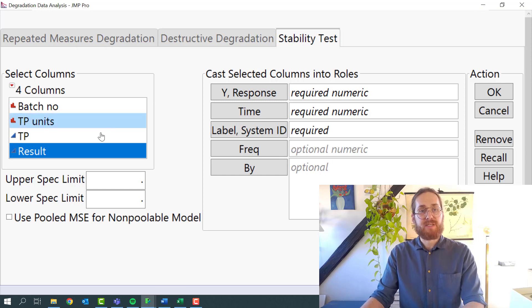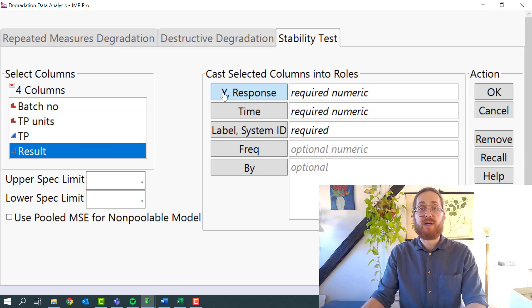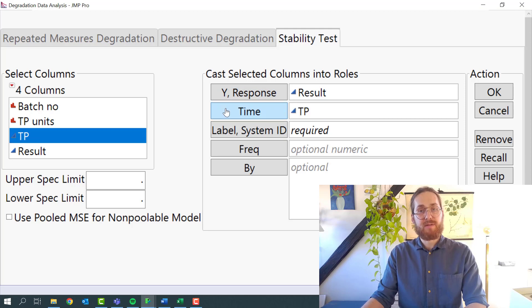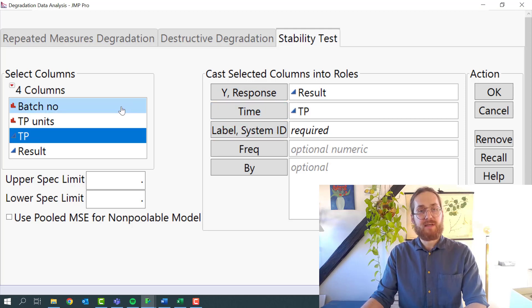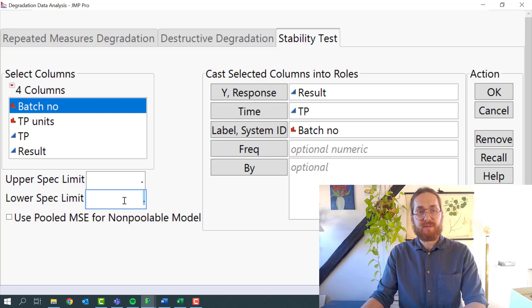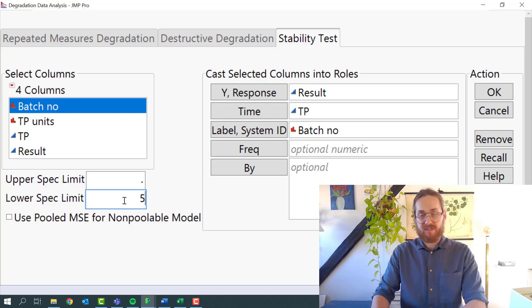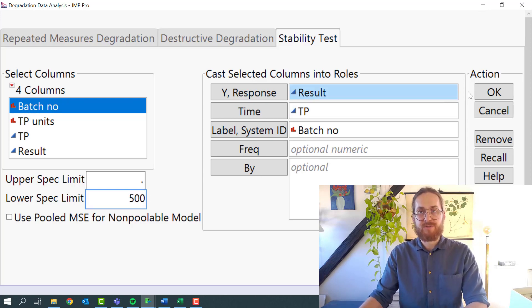Then I specify that the result is my Y response, the time is time point, and the label System ID is the batch number. I then specify that my lower specification limit is 500 and I press OK.